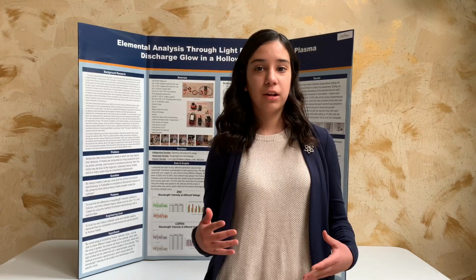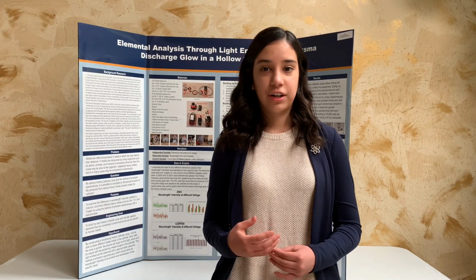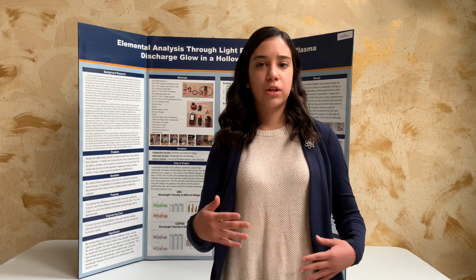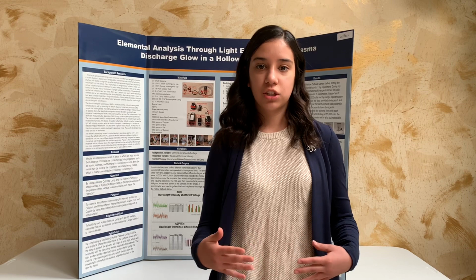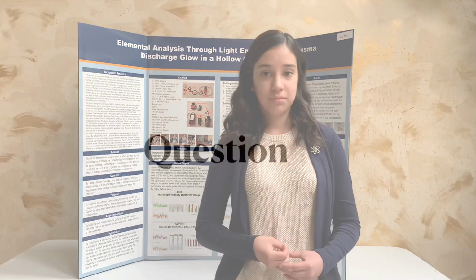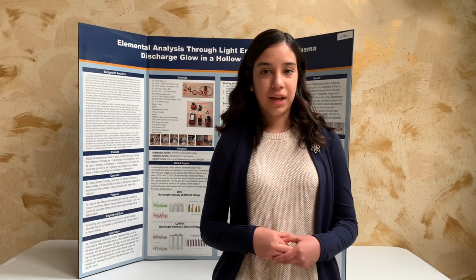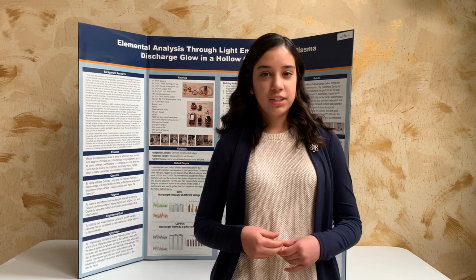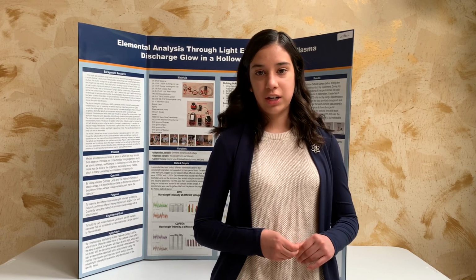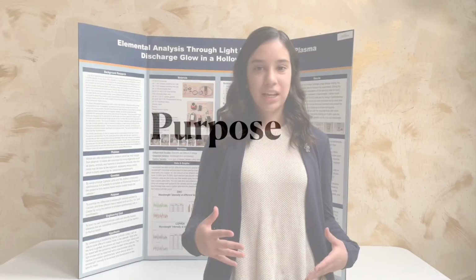The problem that inspired me to conduct my background research is that metals are often encountered in areas in which we may require their absence, and if organisms consume these metals in a surplus, then it may be toxic to the animal, and in many cases, these metals can be considered contaminants. I asked myself, by using a hollow cathode lamp and the method of emission spectroscopy, is it possible for me to complete an elemental analysis of various metals that are located inside of the cathode of my hollow cathode lamp? This is what led me to my purpose.